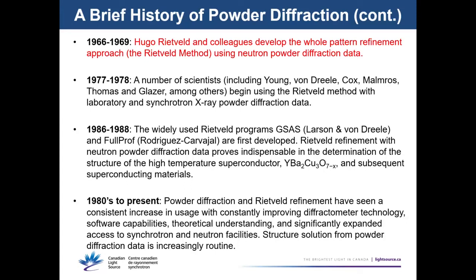Applying the Rietveld method to X-ray diffraction didn't occur until later in the 1970s. And since the 1980s, equipment and software and methodology have consistently continued to improve. So techniques like structure solution, PDF analysis, and synchrotron data collection are becoming much more common and much more routine.